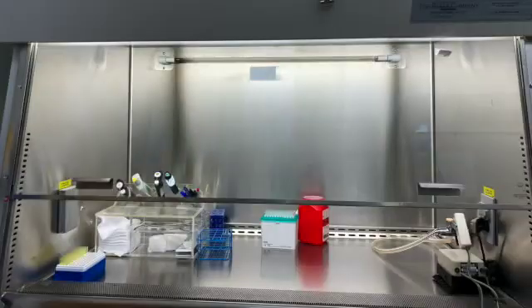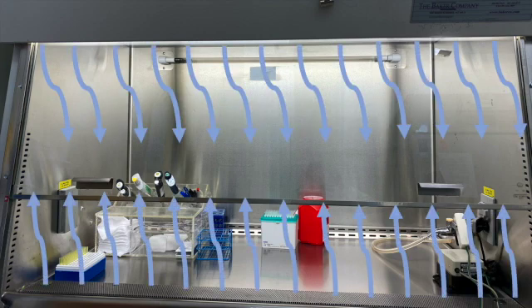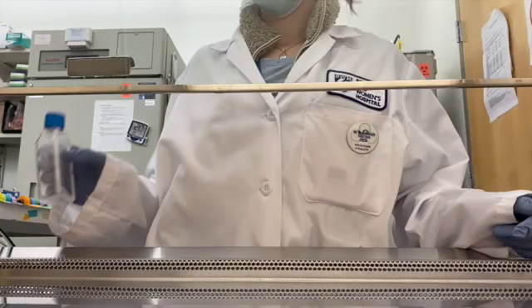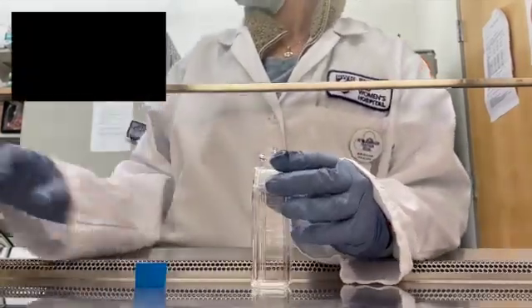sample. Samples are set up in a laminar flow biosafety cabinet which provides high-efficiency particulate air. This means that filtered air circulates inside the hood to create an invisible but effective barrier, shielding the technologist from the sample and vice versa. Cytogenetics suspension samples are usually inoculated into sterile flasks with a screw top.